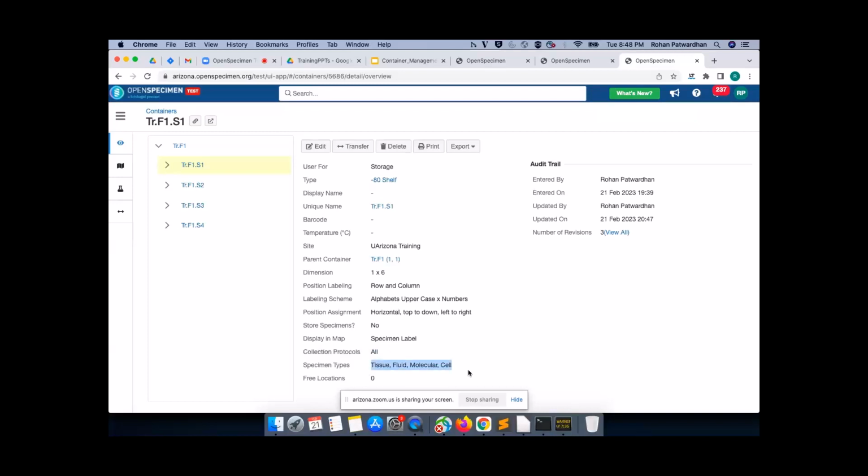I think there was some question coming in. Yes, I have a question. It looks like every type of container has two different categories. Either everything is going to be linear or everything is going to be row and column. Is that correct? That is for every container, yes. Okay. So even something like a drawer, which has one level, but it goes deep several places, we would need to define rows and columns as different orientations. Does that make sense? Yeah, it does.